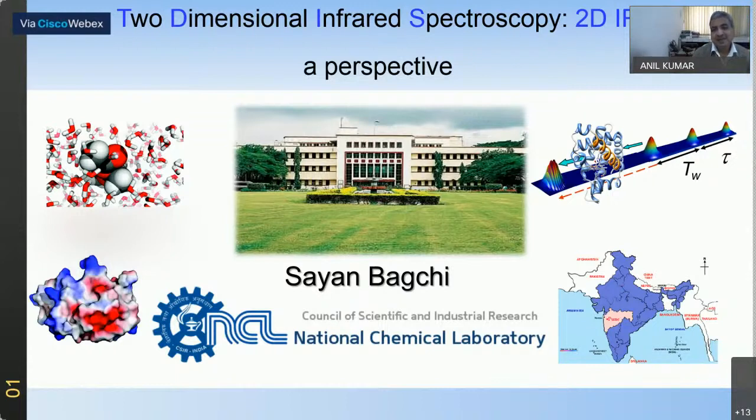Thank you, Dr. Anil Kumar, for this kind introduction. I will start now. As you see from the title of the slide, I will be talking about something called two-dimensional infrared spectroscopy. If we take the first letters, we get 2D IR, so I will give a perspective of 2D IR. We all know about IR spectroscopy, or infrared spectroscopy. Now, for these two dimensions of infrared, the question that needs to be answered, which I will talk about later, is what is this dimension I am talking about?